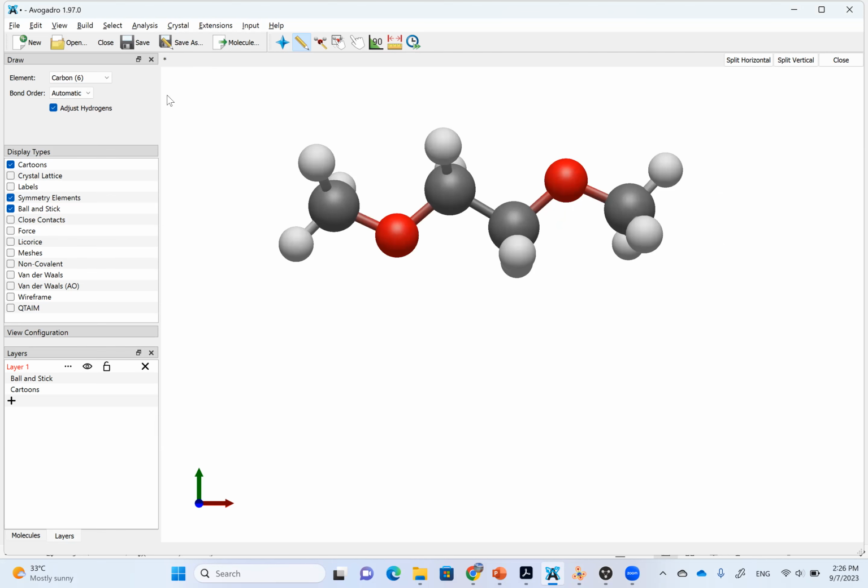Before we go to the next step, we can stay here a little bit and explore some of the properties. For example, we can measure the bond distance. Let's say we go to the measure tools and measure just this carbon and oxygen. You see the bond distance is 1.44, and this makes a lot of sense, right? That's the expected bond distance.